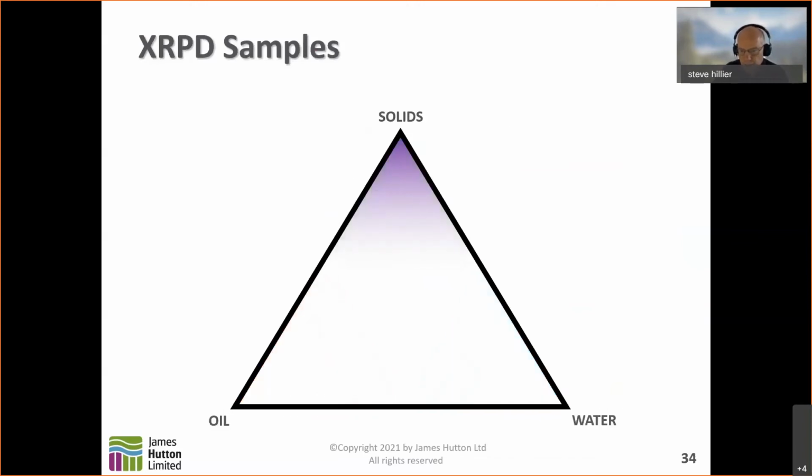And so to join together with the other techniques that you've had, you can see very much X-ray powder diffraction is typically dealing with solids. So we've just colored in the top of the triangle here. Next slide, please.